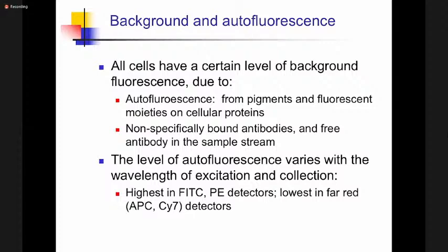These are dyes which are used to label the antibodies before they detect for you the target molecule, be it the granularity of that cell or markers on the surface of that cell. But I've given you a table of all these names of the dyes which you can use.